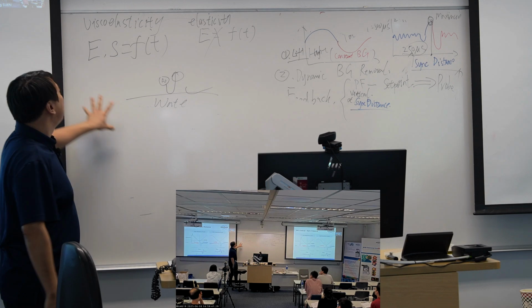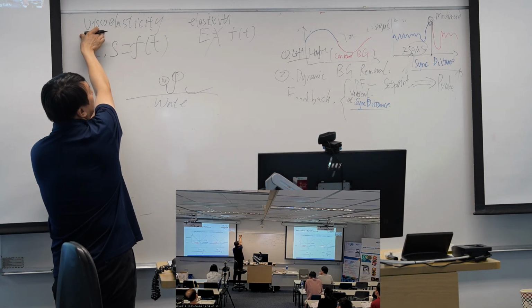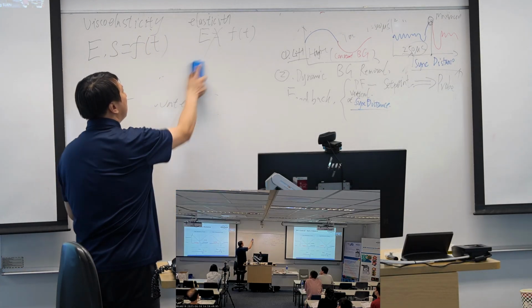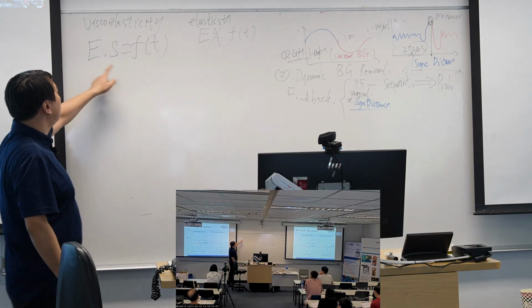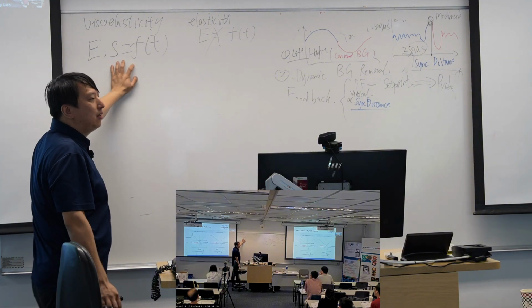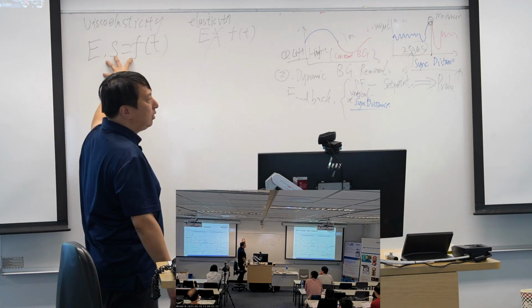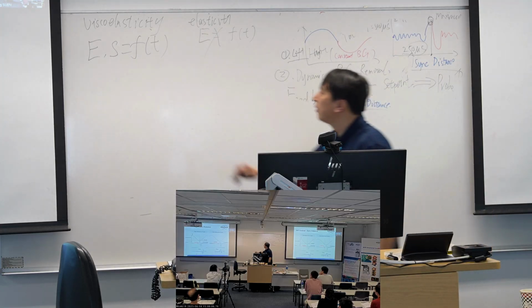So that means everything can express both viscosity and elasticity, and we need to consider time as a function. So the modulus or the stiffness is a function of time. And so for this kind of material, we need to think about its force curve.